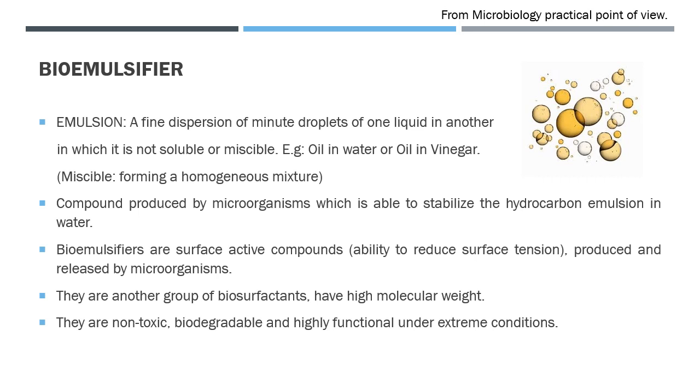Even bioemulsifiers are categorized as biosurfactants. It is one of the groups of biosurfactants, but there is a difference. They are non-toxic, they are biodegradable, and they are highly functional under extreme conditions. For example, many times you get the news that there is an oil spill in oceans, right?